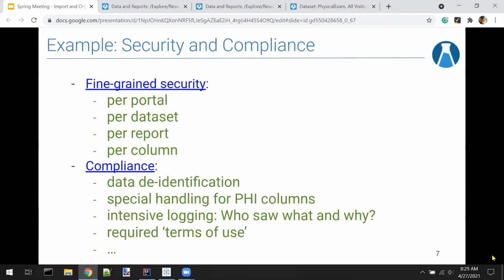Yeah. And then there's a question: when using schema browser and loading views from SQL Server, is there a way to combine these views as loaded in LabKey without using R or other analysis tools to create combined views and simple analysis as you've shown? Absolutely, that's not even a problem. LabKey is very democratic about the databases it can pull from.